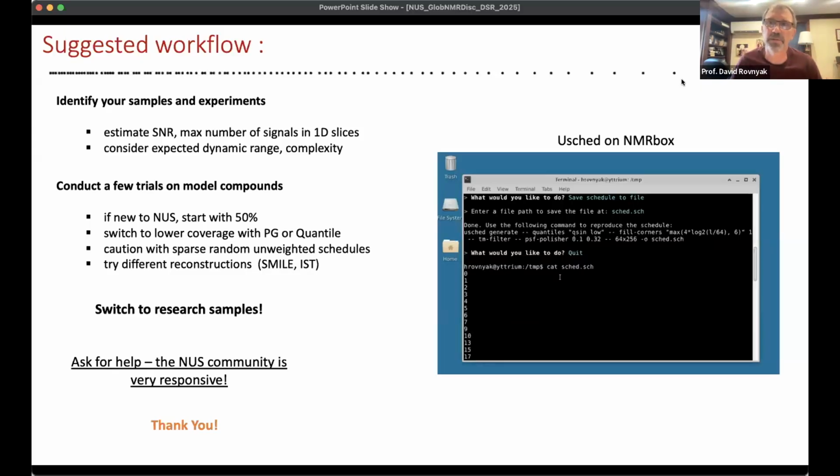If you had two different NUS acquisitions with two different schedules, then indeed that could get tricky, because when you merge the schedules, you may find that certain sample times are the same and certain ones are not. And so you run into that case where you will have both an NUS aspect to your schedule and you'll have an NUWS aspect to your schedule. And so you will have the combination of the two if that happens to be the case. And then it's a matter of whether or not that's currently supported in your given software.